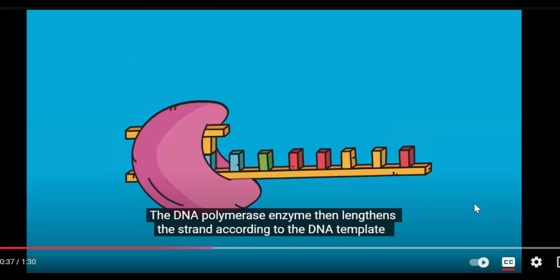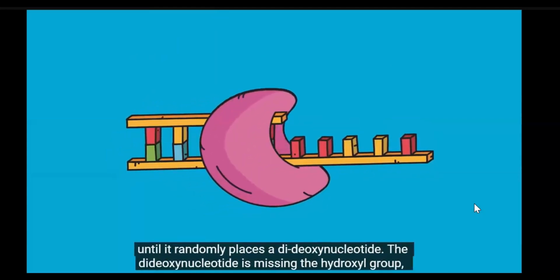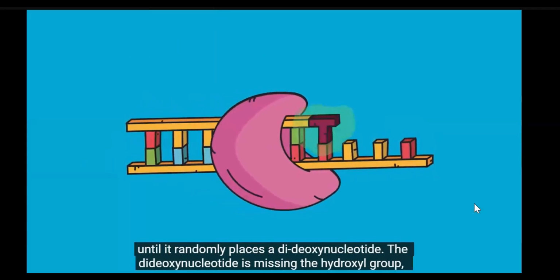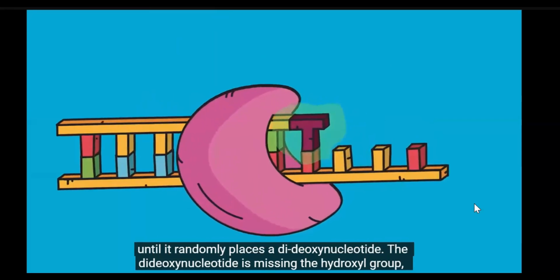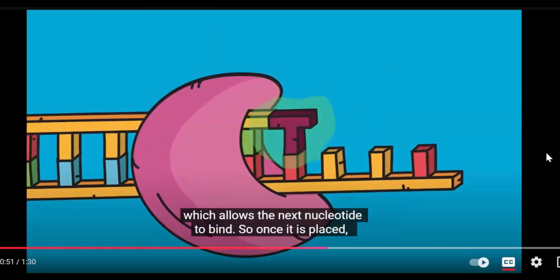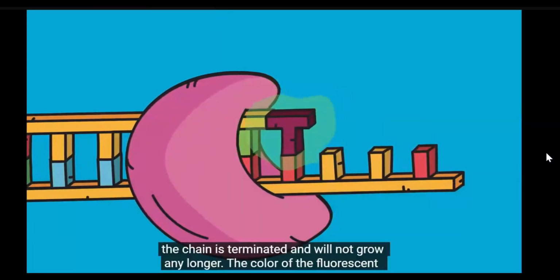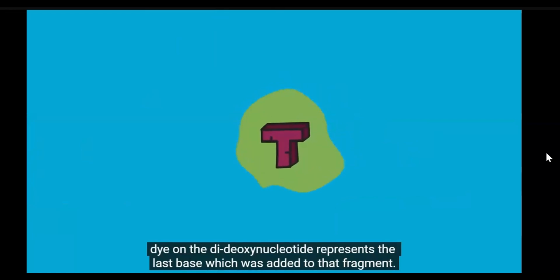Now the polymerase extends it, and as it comes across a dideoxynucleotide, the process terminates. No further extension is possible, and the DNA fragment that is generated is of a specific size.